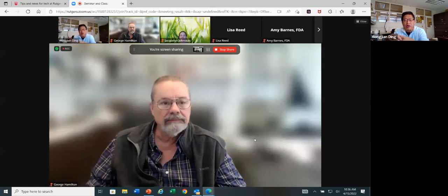It destroys a lot of things, but the chitin is pretty stable. It should work. Also, with image analysis, you don't destroy your sample, you just take a high quality, high resolution image, so it should be fine.